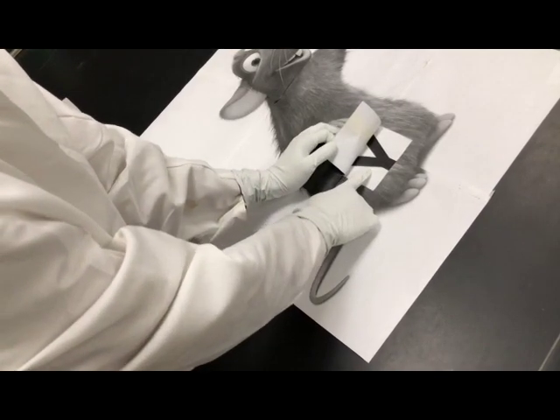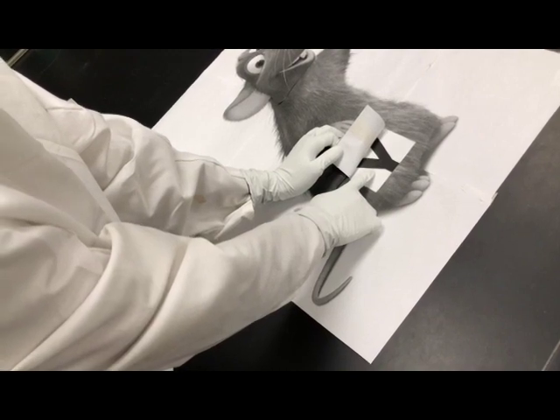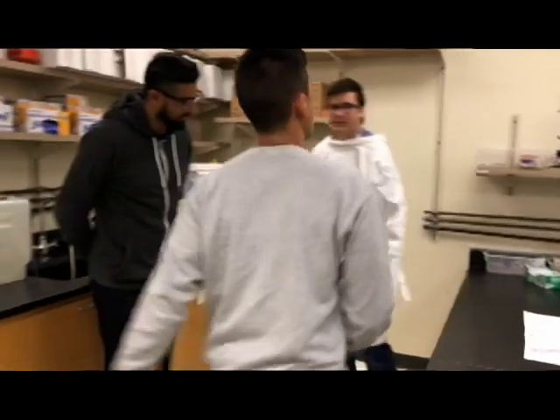Dr. Chris, here's the bicornuate uterus. Do we need baselines on that? Yes, doctor. Let's get some baseline contractions going. Where's the technician at? Hey, can we get some isometric transducer set up, please, for some baseline contractions? Right away, doctor.